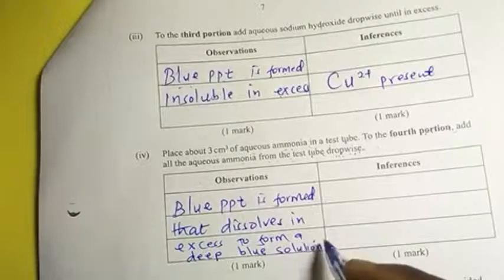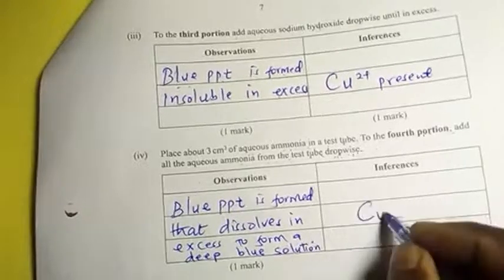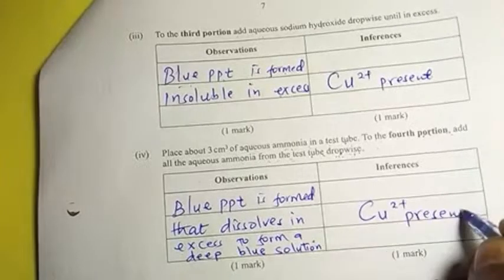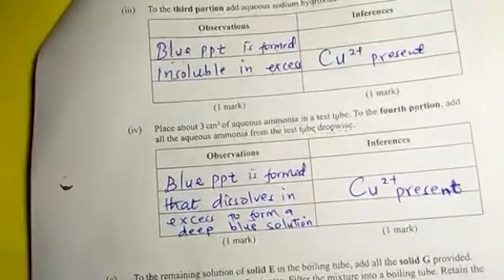A deep blue solution. That tells you it is copper 2 ions that are present. So when you find things repeating themselves like this, don't worry.